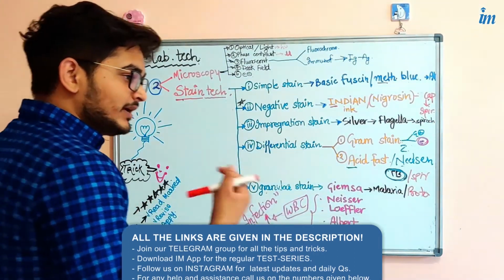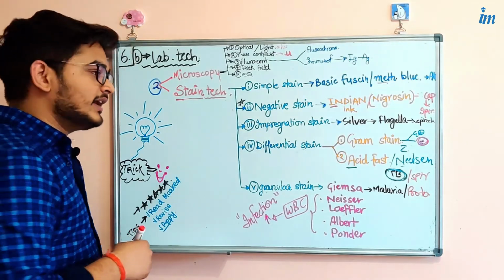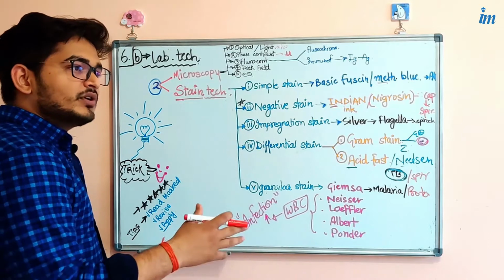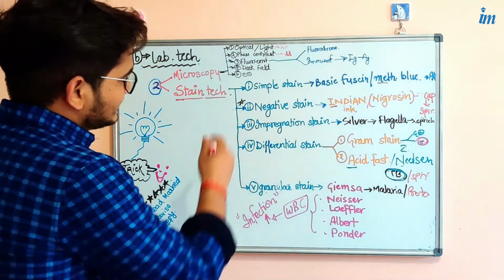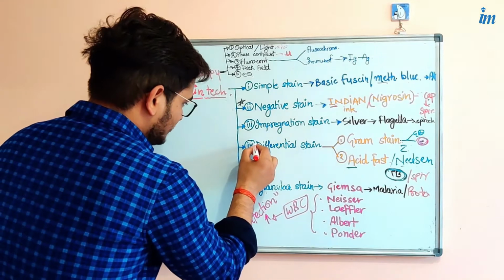As in my second video I told you about the gram staining and the concepts behind it, the classical gram stain and modern gram stain, and the question point of view, which is being asked in the NEET PG, FMGE and USMLE examinations. In the staining technique there is a variety of categorizations given.